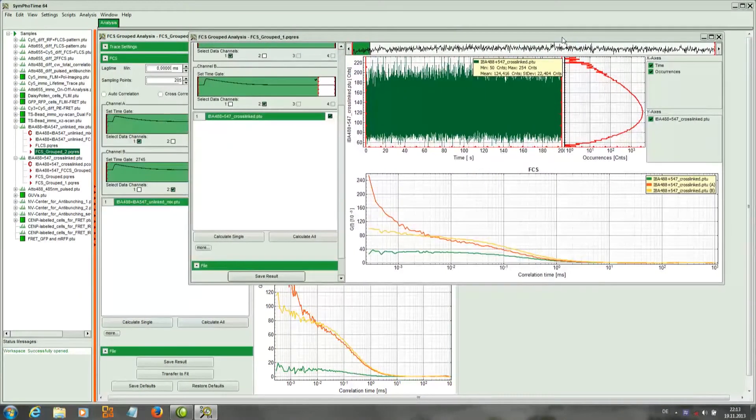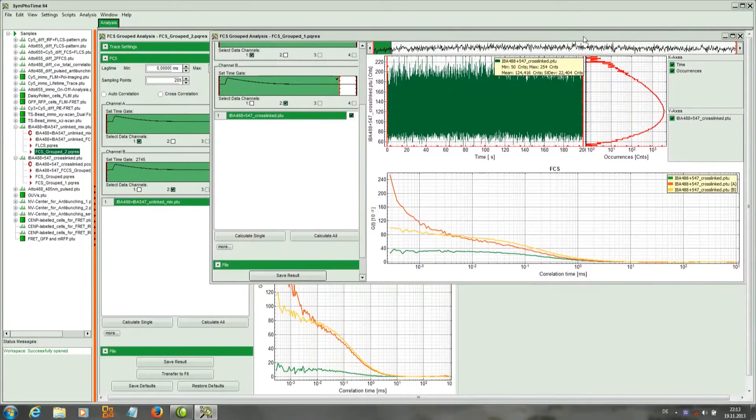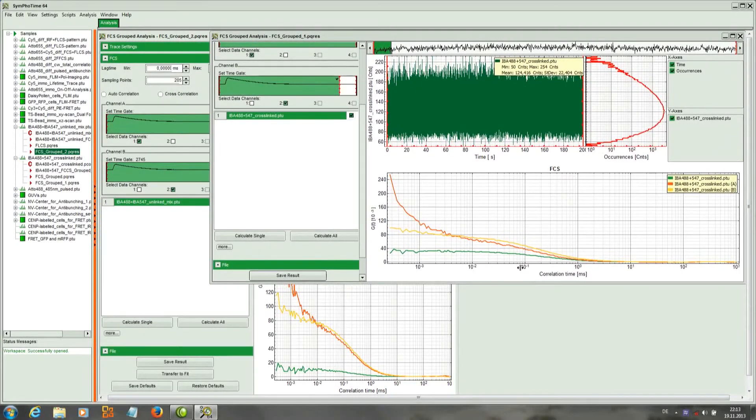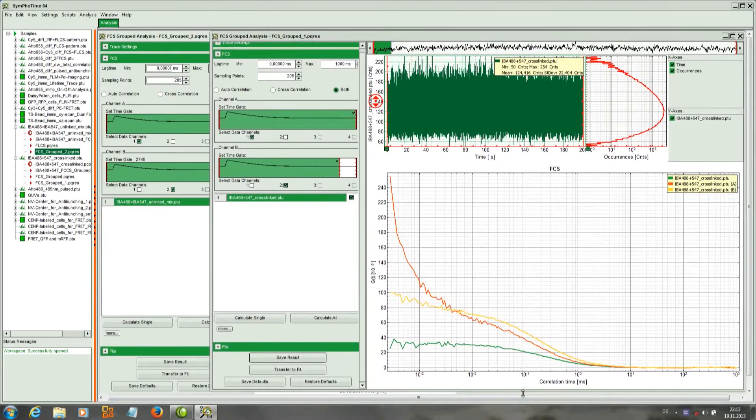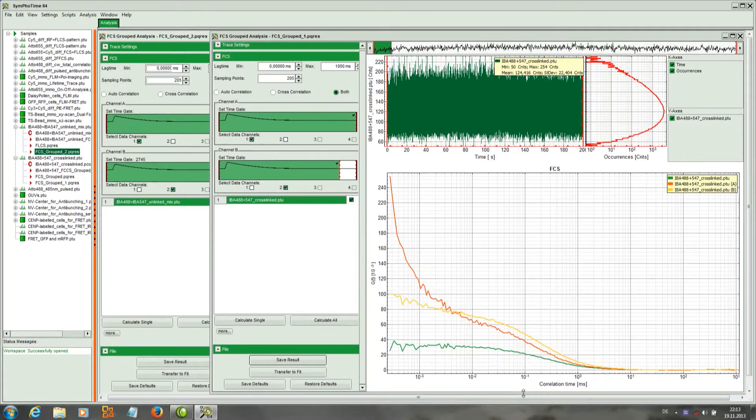On the left, I put the unlinked sample. On the right, I put the sample where the two dyes are on the same oligonucleotide and therefore moving in a coordinated fashion.